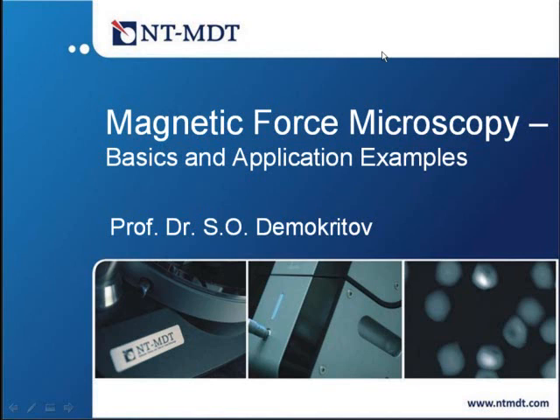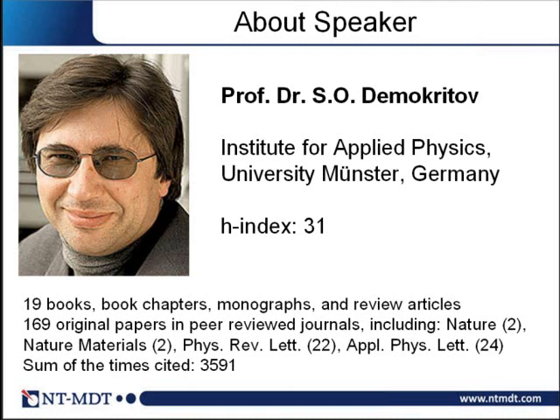Okay, let us start. As you probably know, magnetic force microscopy is a part of atomic force microscopy, and in general the goal of magnetic force microscopy is to image magnetic states of different magnetic materials and samples and devices.